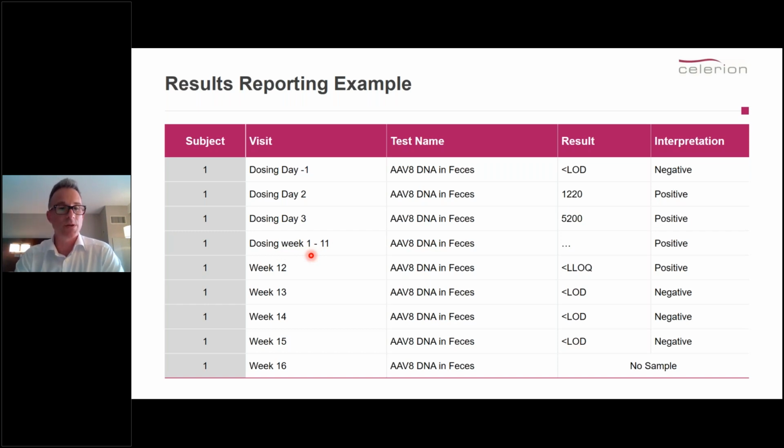Here's an example. I chose a week 12. But it could be week 20. You start to see a drop below the limit of quantification, and then weekly after that below the limit of detection, and then you need to be focused and on it with your sample analysis, because these 3 consecutive below LOD results make a huge impact. So you want to be timely in reporting that. You don't want to continue too much, and you don't want to not be ready when you get those samples.